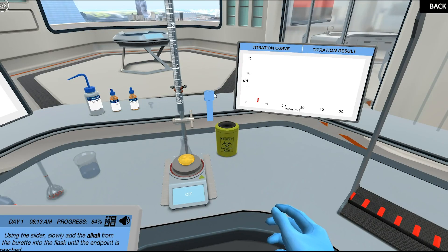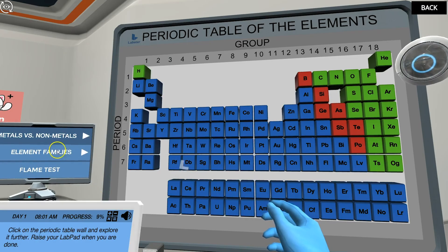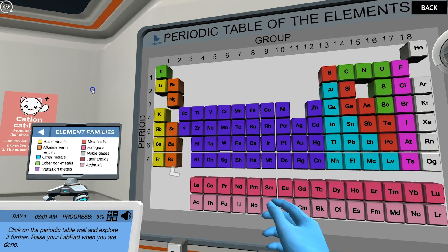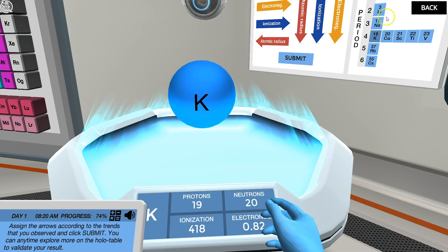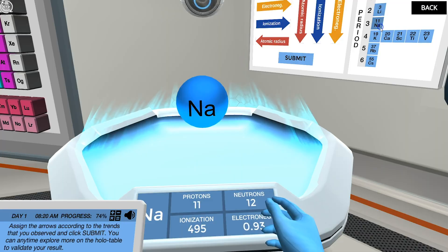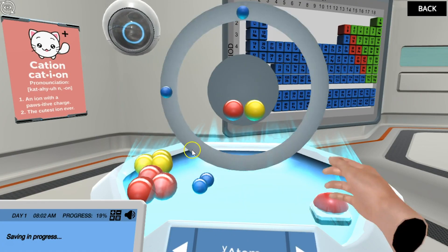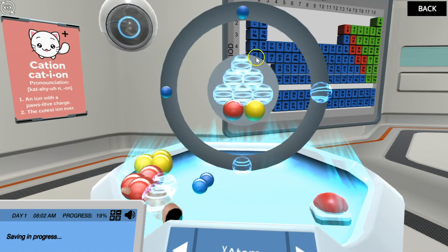A brand new plotting feature tracks the pH measured by the student and presents true data in real-time. Students are able to predict trends with the interactive periodic table, explore the properties of different atoms, and build their own atoms, ions, and isotopes on the holo table.